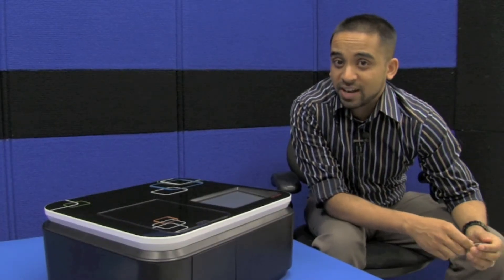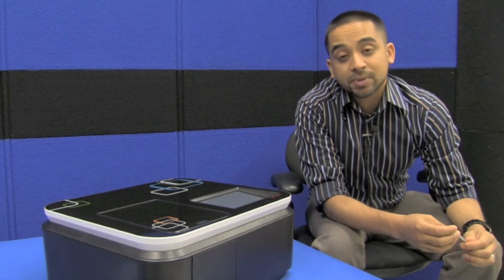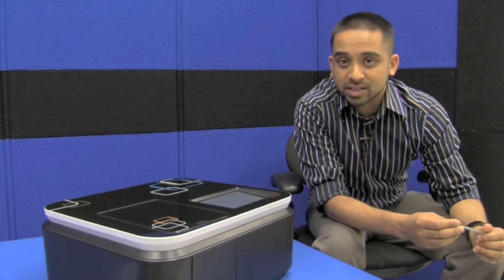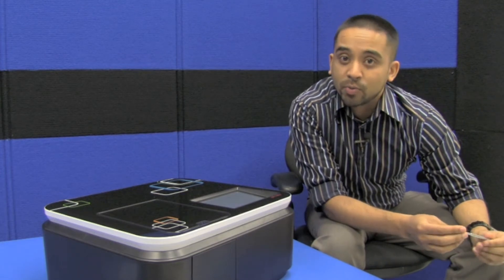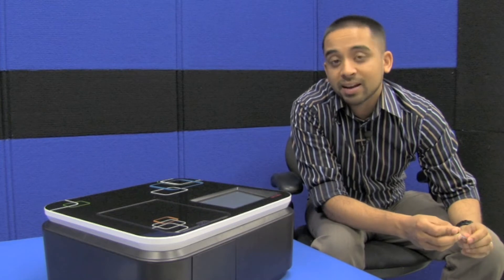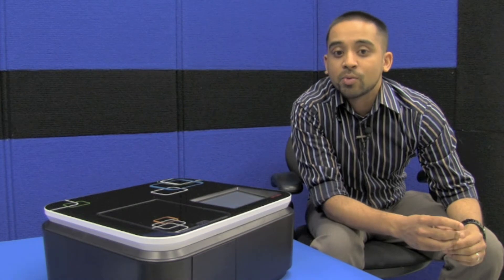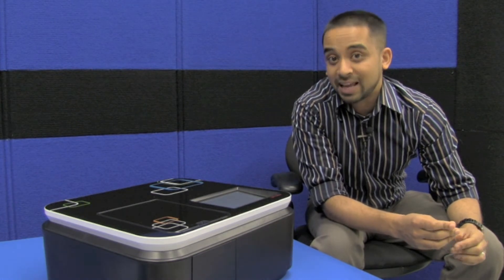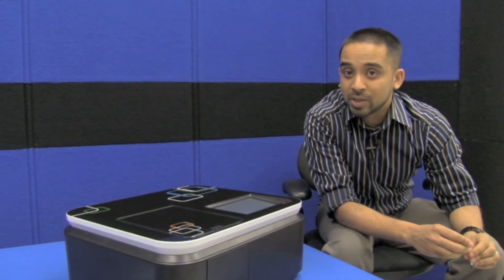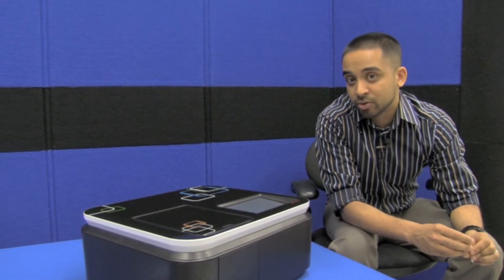Among some of the product specifications you'd expect from a UV-Viz Spectrophotometer, the Optus and Pop has some very impressive numbers. To start off with, it has a spectral bandwidth of less than 1.8 nanometers, which very quickly takes the product into a research grade — surprising because it has a very economical price point. The device covers the full wavelength range of 190 to 1100 nanometers and has accurate and reproducible results.